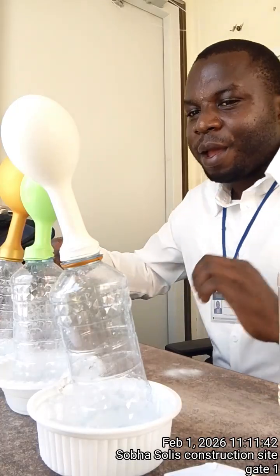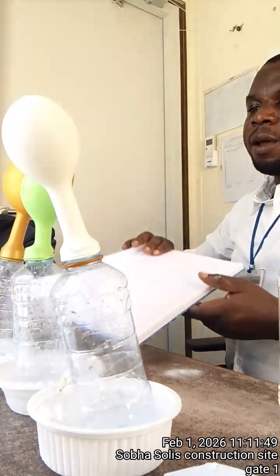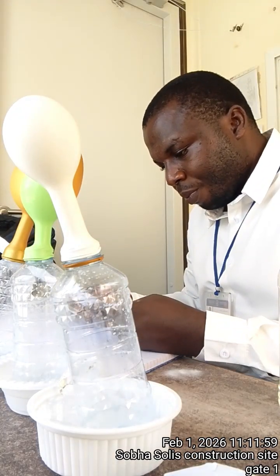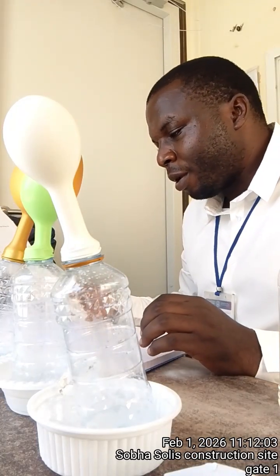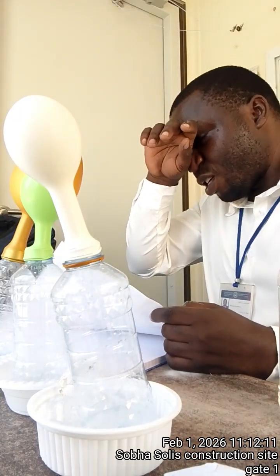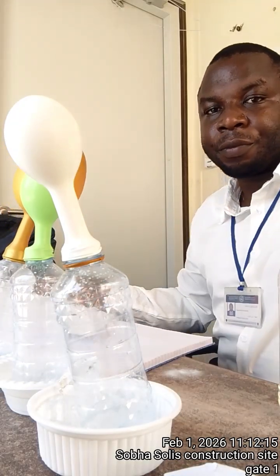Dear members, it is time for our experiment to show the results we are observing so far. When you are dealing with this in the assignment, it tells us to place each bottle in one of the water baths already installed. From there, the time taken, we are measuring in seconds.